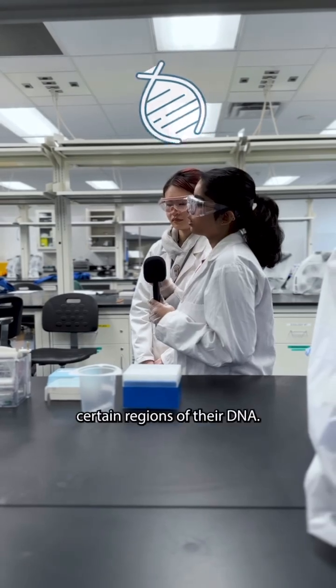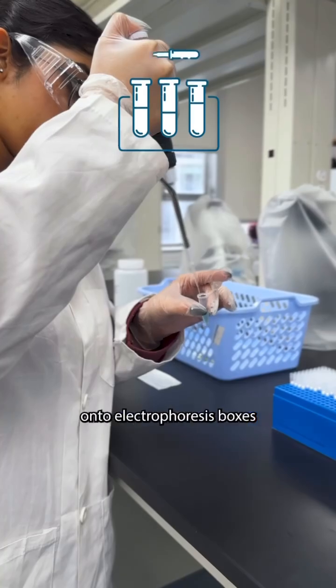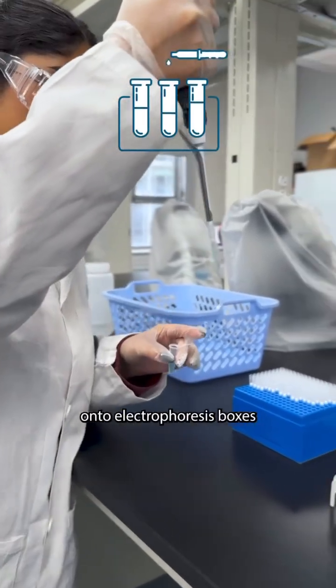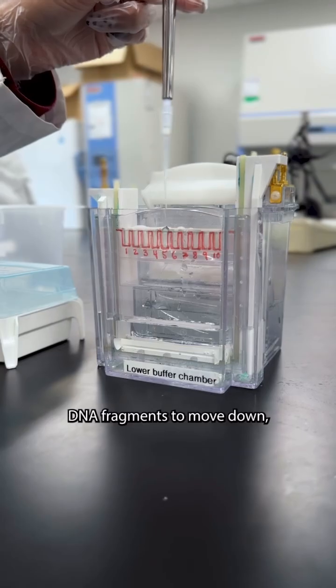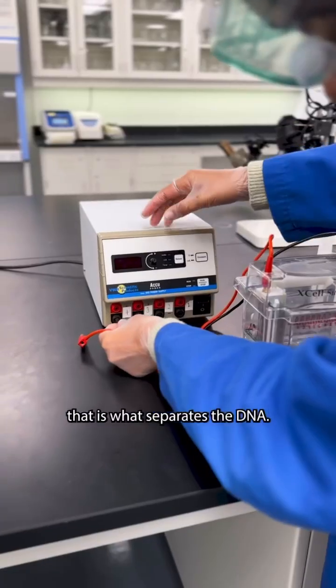The next step, they amplify certain regions of their DNA. With those DNA fragments, they load their samples onto gel electrophoresis boxes and this allows the DNA fragments to move down. The DNA is run under electricity. That is what separates the DNA.